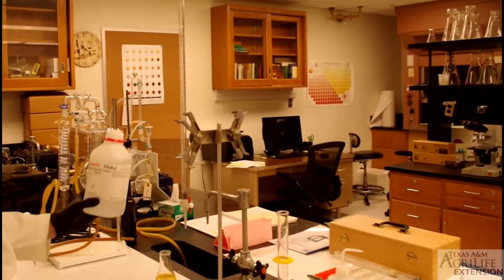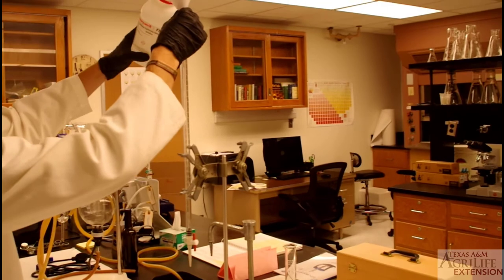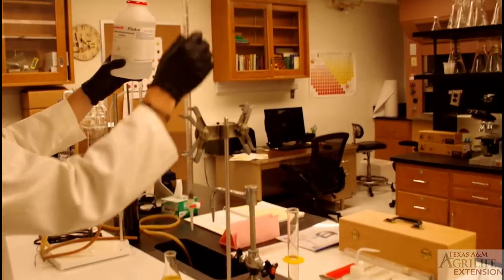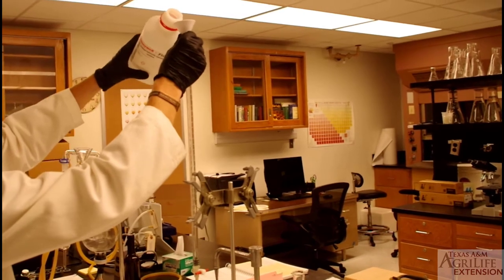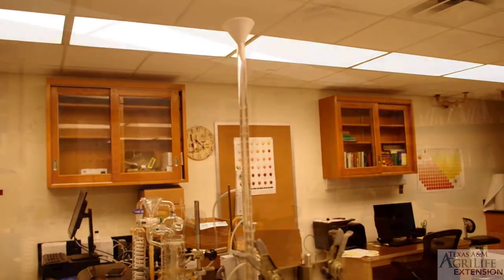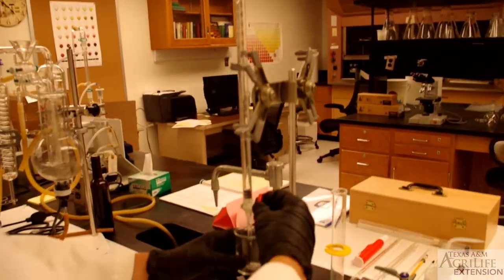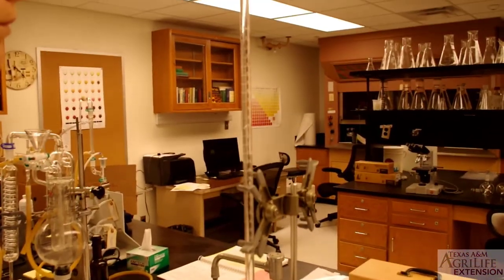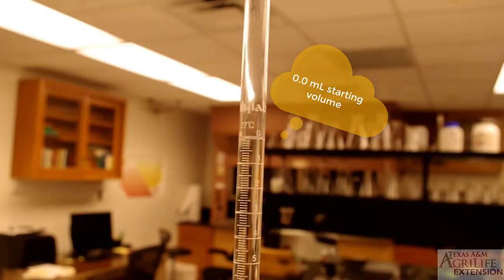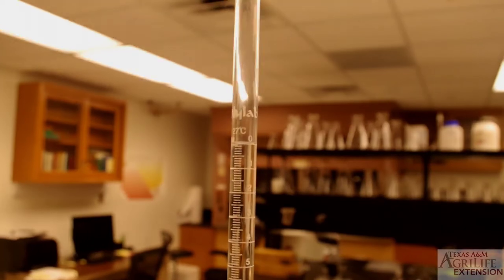We start by filling our burette with a standardized sodium hydroxide solution. Make sure the stopcock is in the closed position. We remove the excess sodium hydroxide solution from the burette using a waste beaker. We make a note of the starting volume of sodium hydroxide in the burette, in our case 0 milliliters.